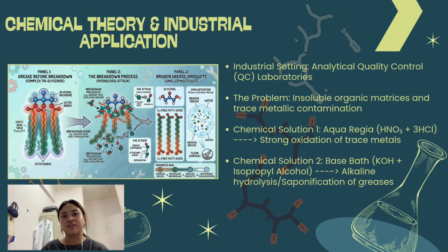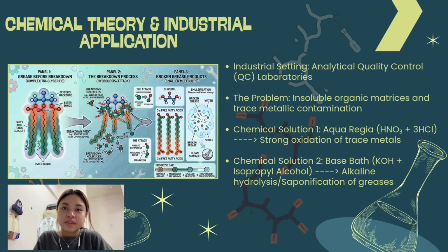The chemical theory here relies on a powerful synergistic effect. Nitric acid acts as a potent oxidizing agent, while the chloride ions from the hydrochloric acid coordinate with metal contaminants, forming soluble chlorocomplexes that easily wash away, leaving the glass surface completely free of trace metal artifacts.